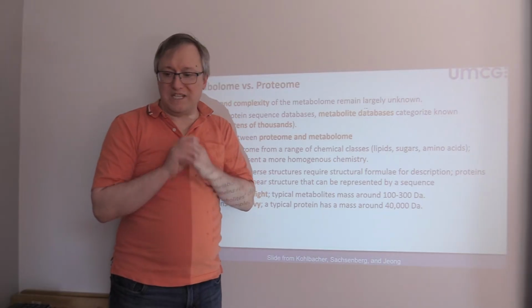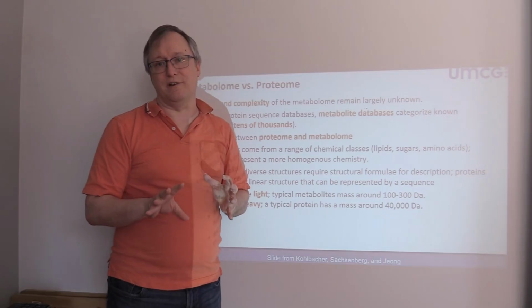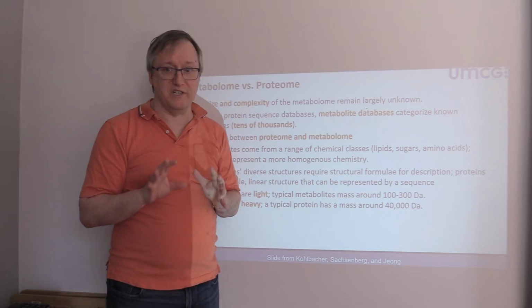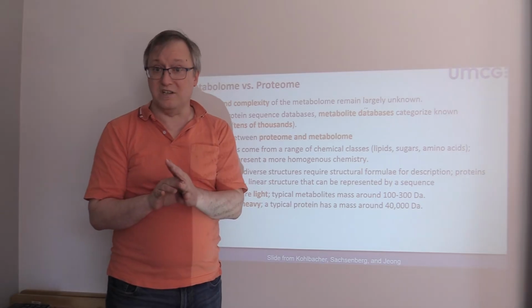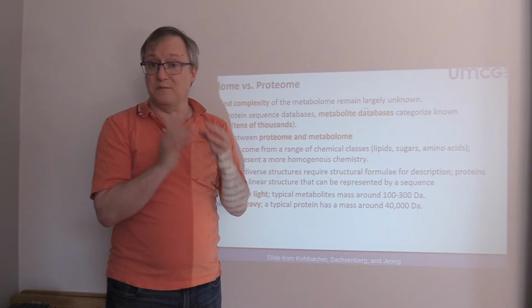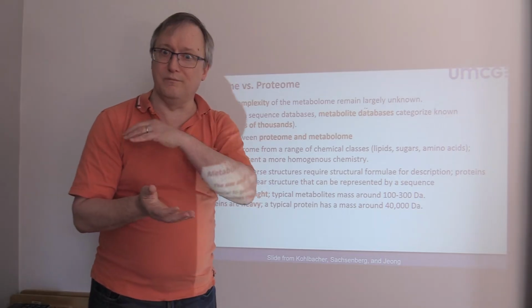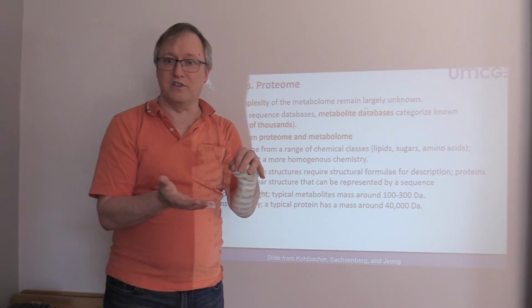Now, the metabolome and the proteome have very different problems to solve. So we'll start by saying that although it's pretty straightforward today to produce an annotated genome for a species, we can then say this set of protein sequences is possible for the central dogma to take place upon, that we have the transcription of this gene.